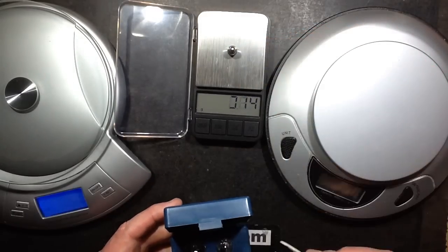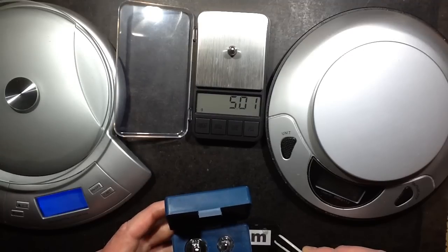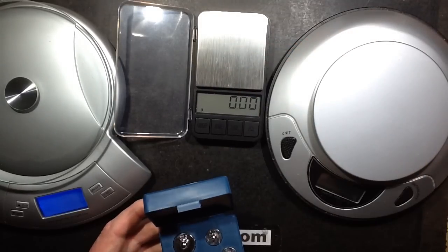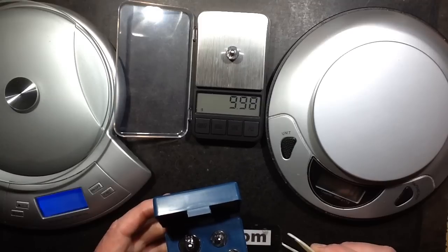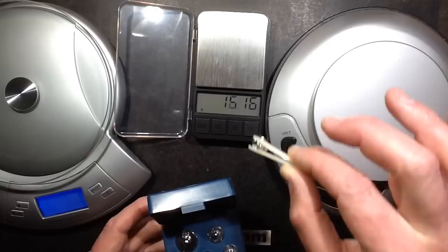This is the five gram weight, and it's coming up at 5.01 grams — that's very accurate. Ten gram weight, and that's coming in at 9.98, so they're coming in within about two hundredths of a gram.